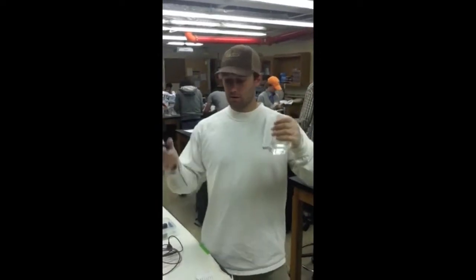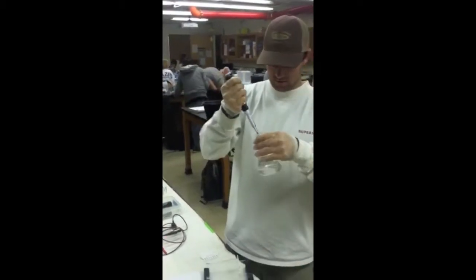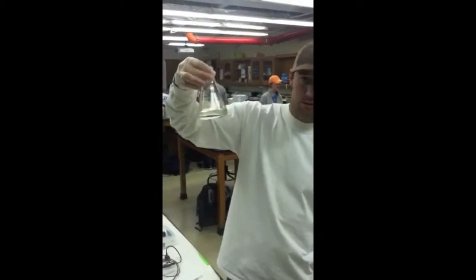Now that we're below 60 degrees, we're ready to load 6 microliters of ethidium bromide into the solution. Now that's in, make sure you swirl it completely so it's completely mixed.